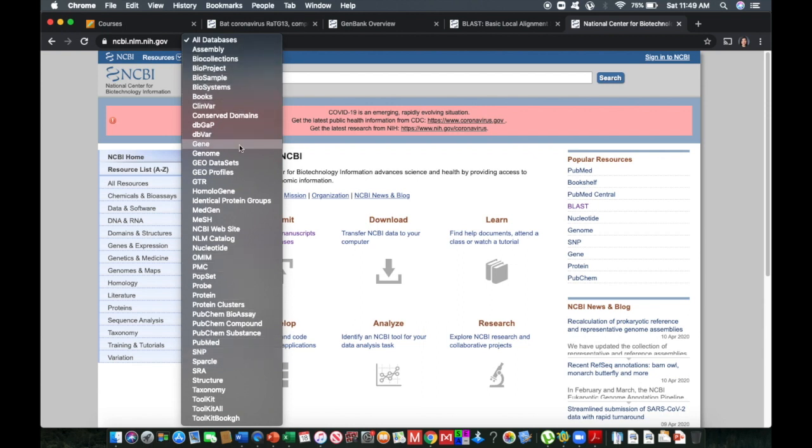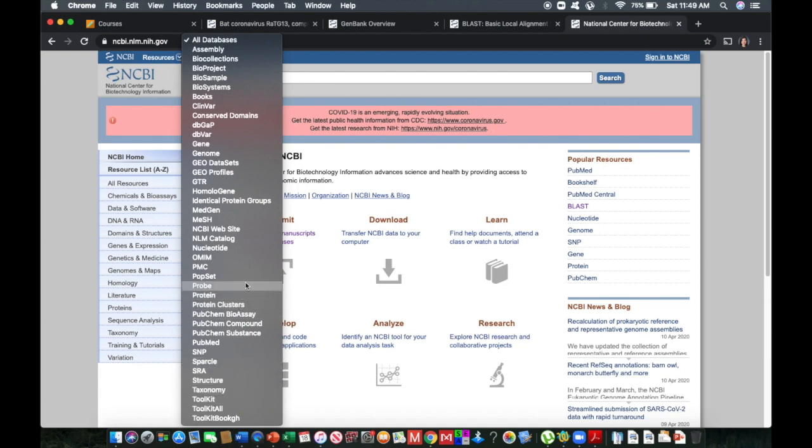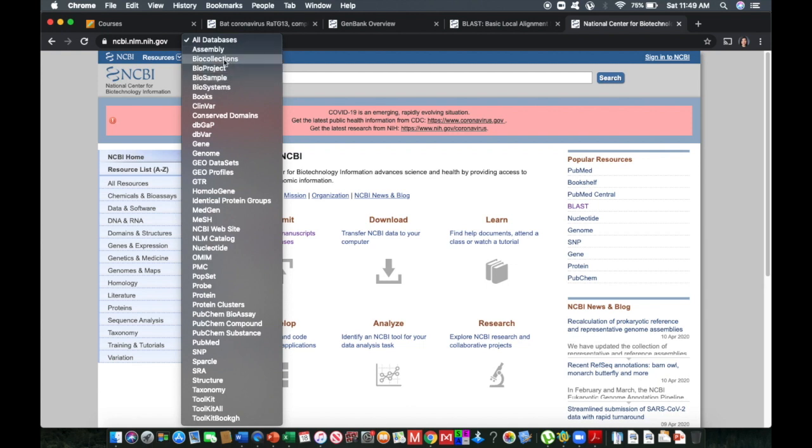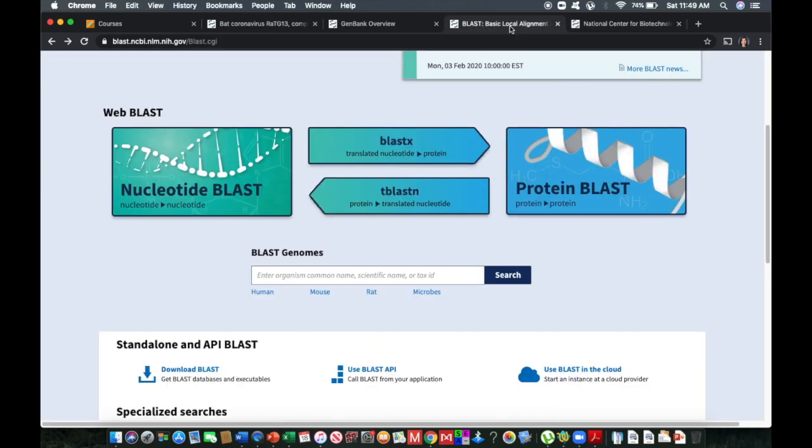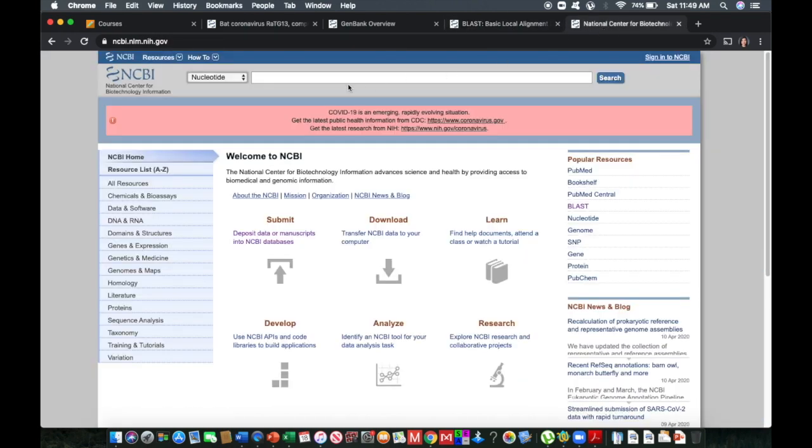So gene, genome, even publications are available here. Assembly, bio collection, bio samples, nucleotide. So we're going to focus on nucleotide searches as well as the BLAST feature.